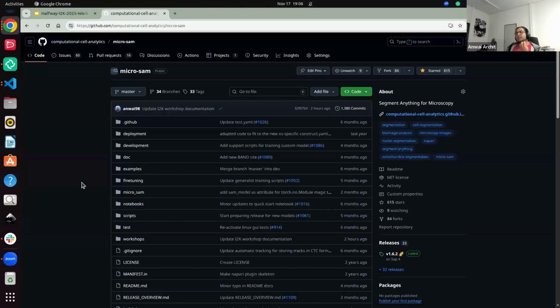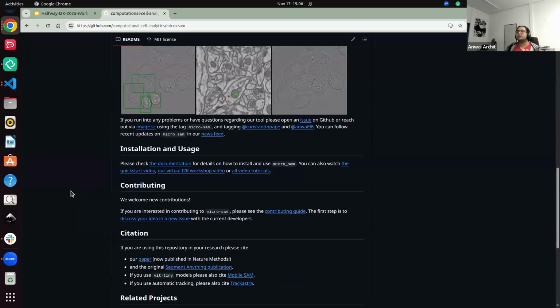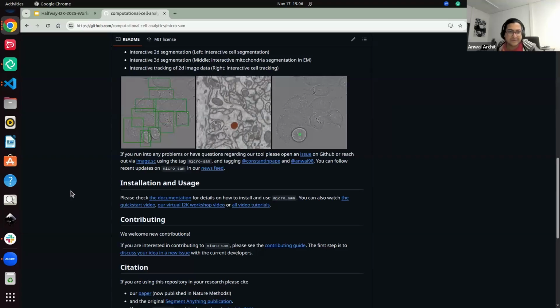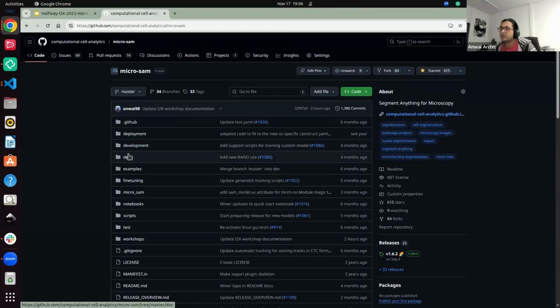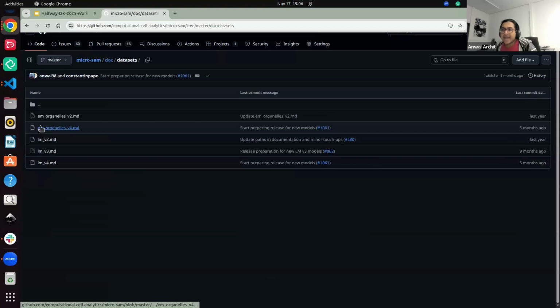Okay, so the newest one, there's nothing really different compared to the videos you will see or what we have also talked about before with you, Philip. There's nothing new. It's just we have a bit more data. If you are ever in doubt that they are doing something funny, go to our docs, go to datasets, and everything is documented on which model is trained with what data, how much data, what is done.